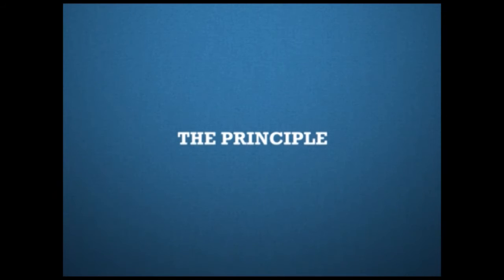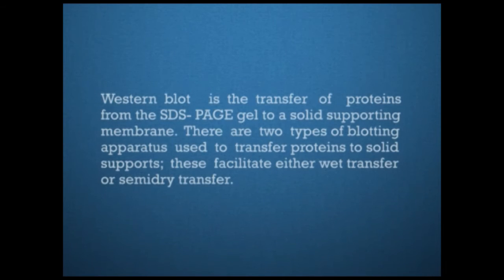The principle. Western blot is the transfer of proteins from the SDS-PAGE gel to a solid supporting membrane. There are two types of blotting apparatus used to transfer protein to solid supports. These facilitate either wet transfer or semi-dry transfer.